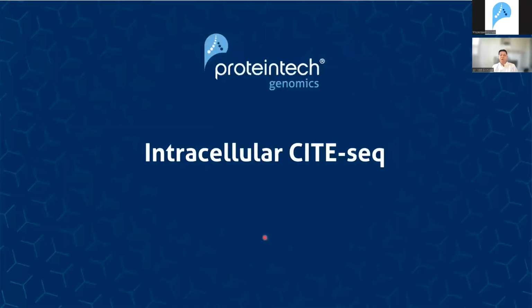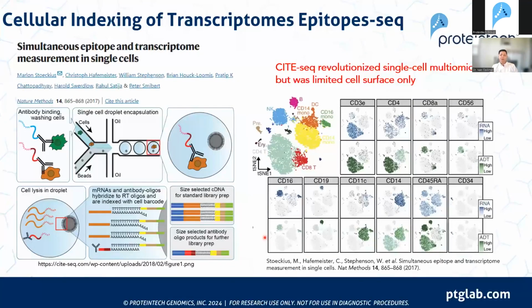All right, so I will pivot now to intracellular CITE-seq and begin way at the beginning in 2017, where there was the introduction of these multiomic, particularly protein and single-cell RNA-seq assays.